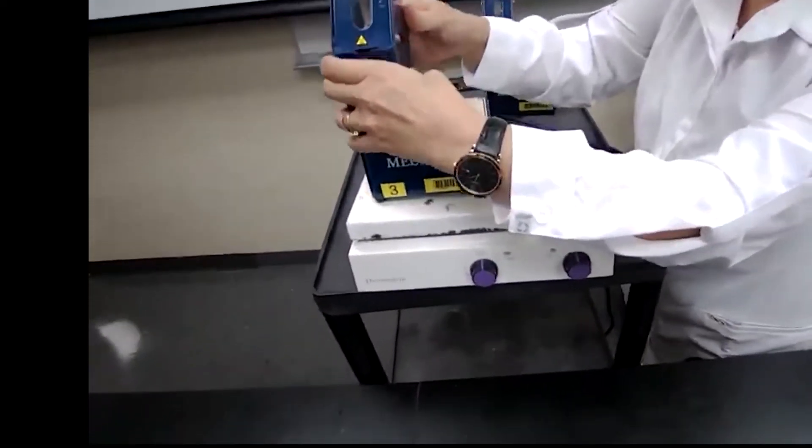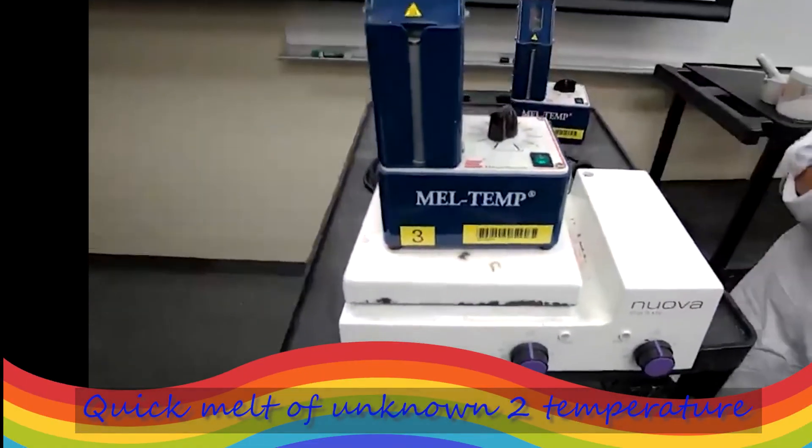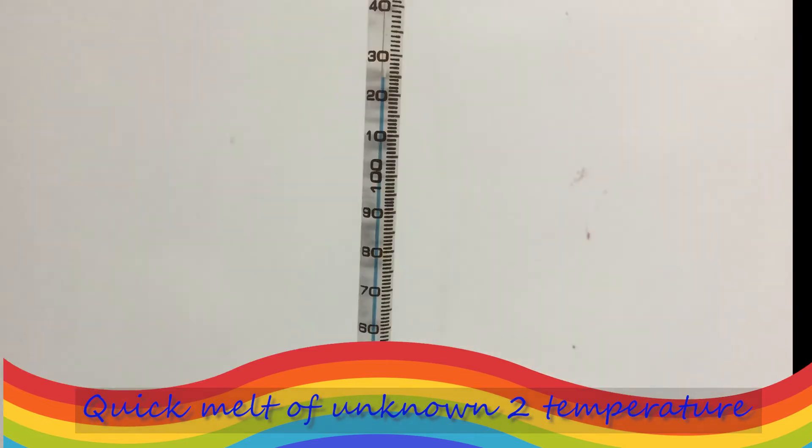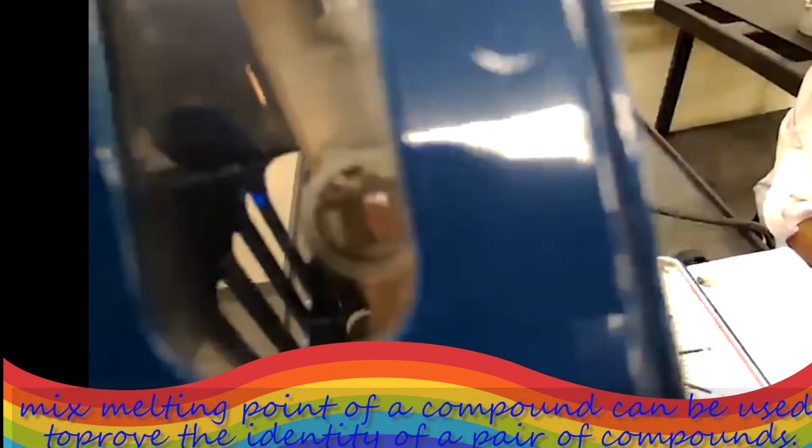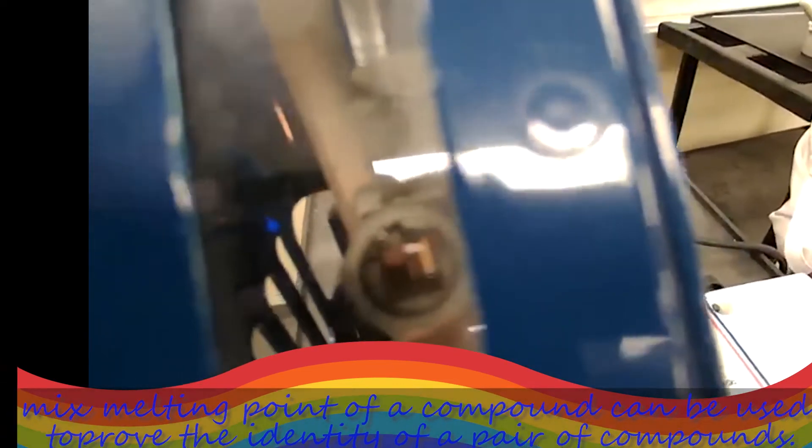Step three for this one is going to be mixed melting point. So as soon as I find the melting point for this sample, I'm going to look at the table and find three compounds that they have very close melting point to my unknown number two. And with the mix, like I will make like a 50/50 mixture of my compound, the unknown with each of those three samples.